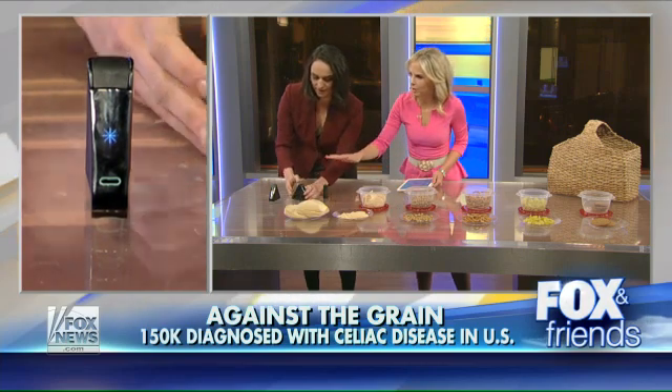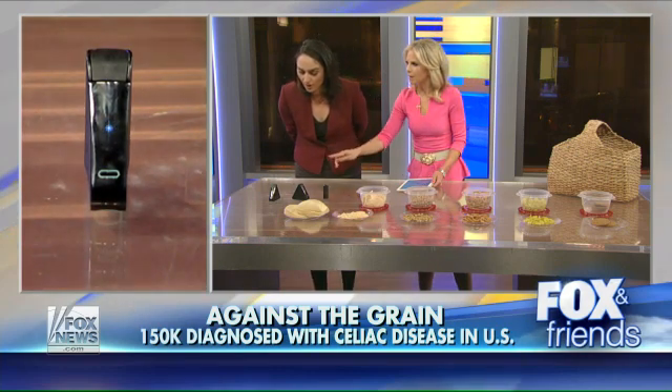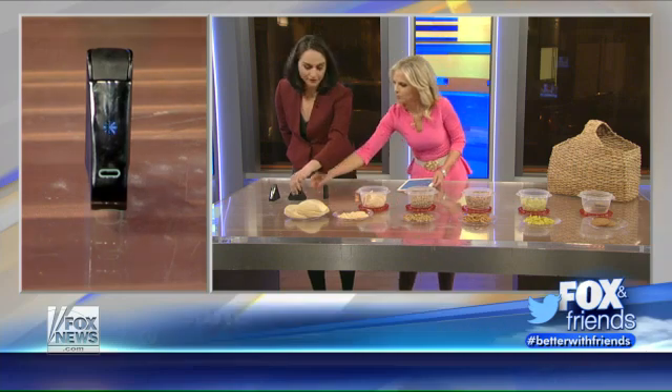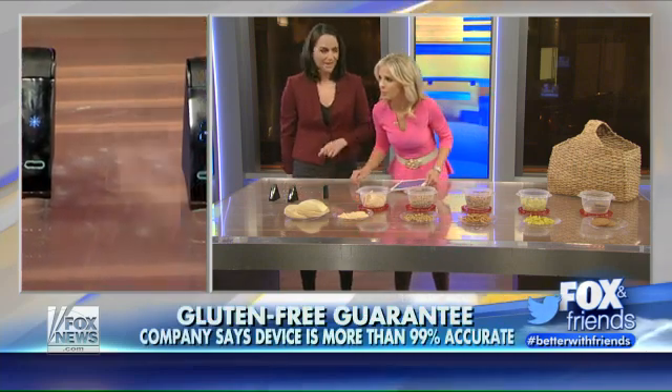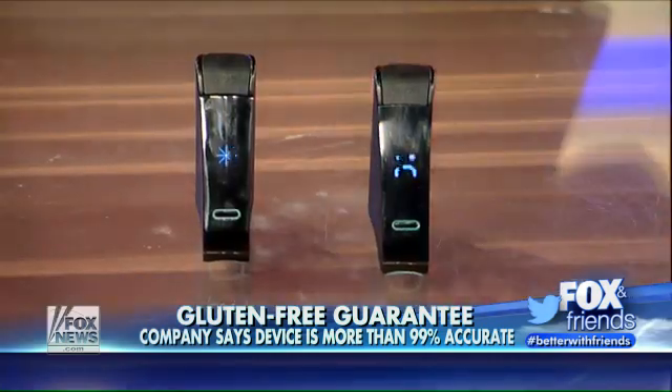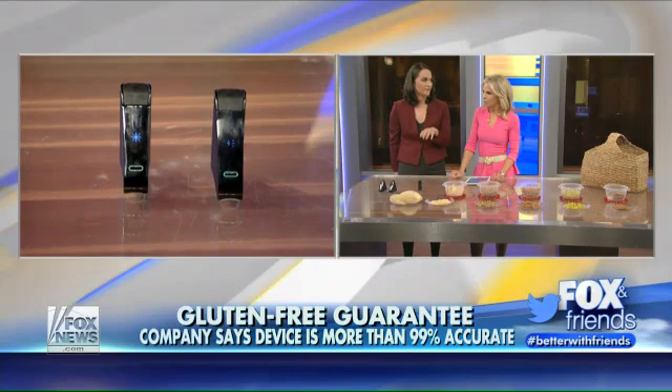So this is going to just run through. I'm seeing something blinking on the first test you ran here. What is that symbol, and what are we looking for when it pops up? This is going to show us if it's gluten-free — it's a smiley face right here. So this one is gluten-free. And then we see a smiley face, and then it's going to cycle into a sad face. A smiley face shows gluten-free, sad face shows there's gluten in it.